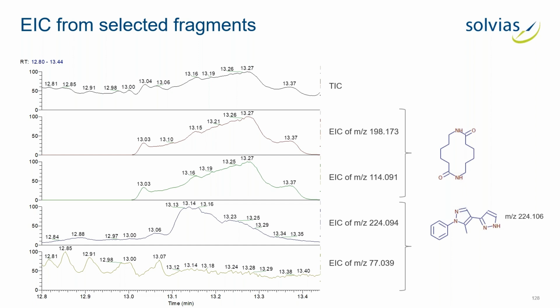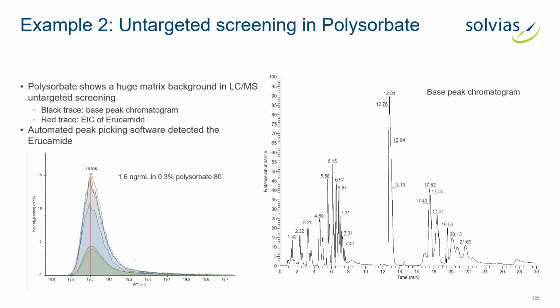So we had, for example, our 2 candidates and were seeing, okay, one of the signals that we thought belonged to the second candidate actually doesn't belong to that candidate. And it turned out, after we did the automatic deconvolution, that it belongs to another candidate. But this shows that we can do it manually, but the automated workflow is first faster, and second, it's much more accurate.